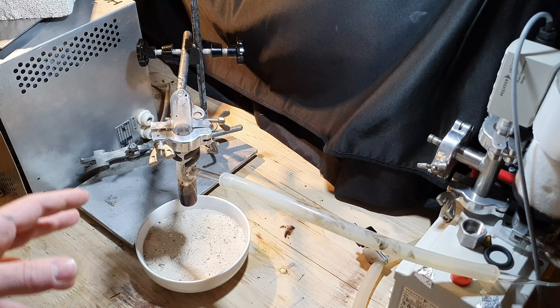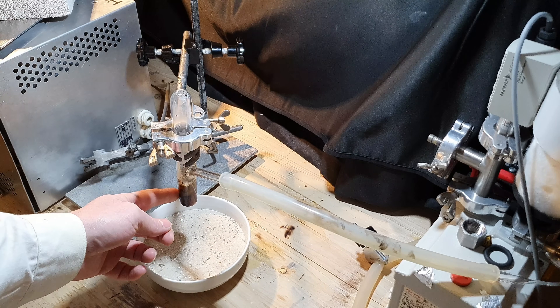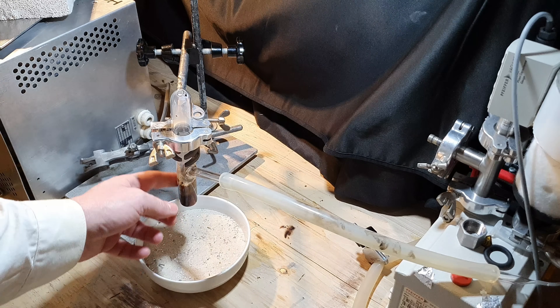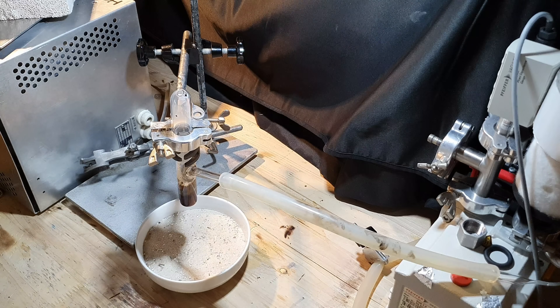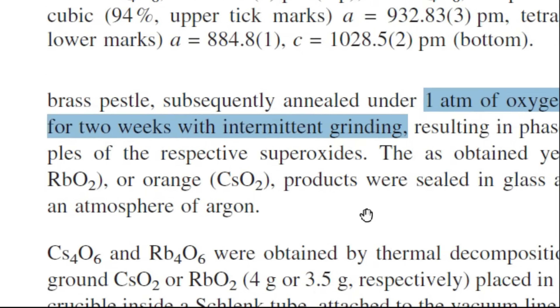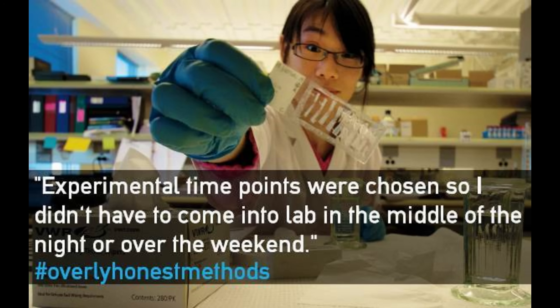Since the reaction isn't proceeding any further, I'm now going to reattach our argon, open up the reaction vessel, stir the contents and close it up again. Then I'm going to reconnect the oxygen and heat it to 290°C. According to the paper, the conditions are one atmosphere of oxygen, 290°C, for two weeks. While there is the possibility the person responsible went on vacation and just left the cesium in the oven, I don't know that for sure, so I will have to let it react for the mentioned time.